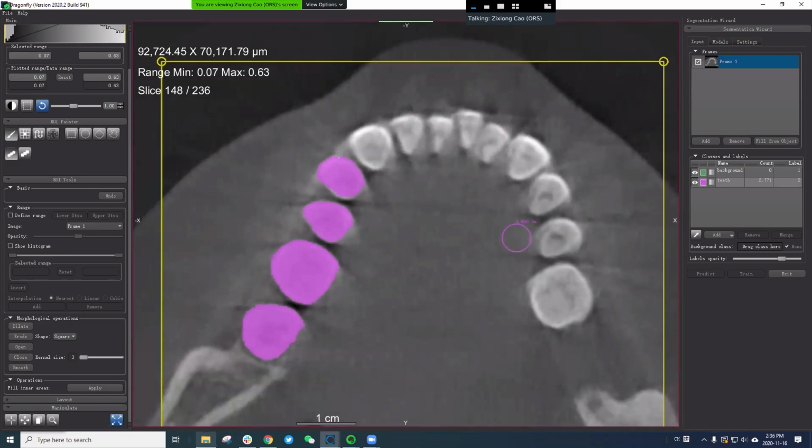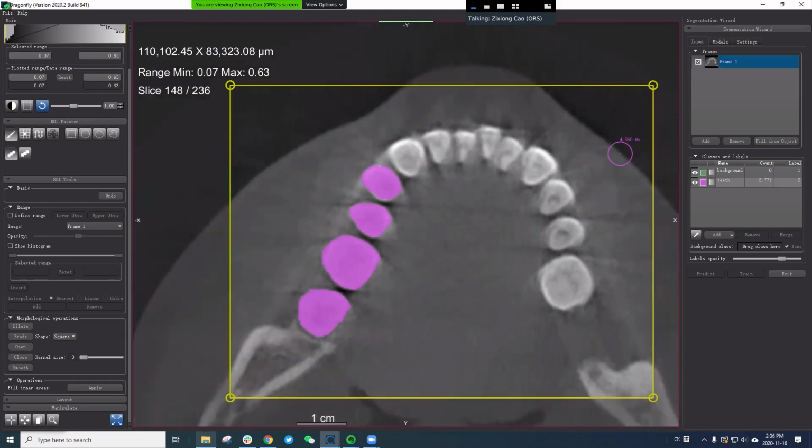And I can continue to finish all this. Then I will be ready to use this frame for deep learning. Before that, I would just check. I want you to start working now with your frames. So I want to check if you have any questions with your frames.